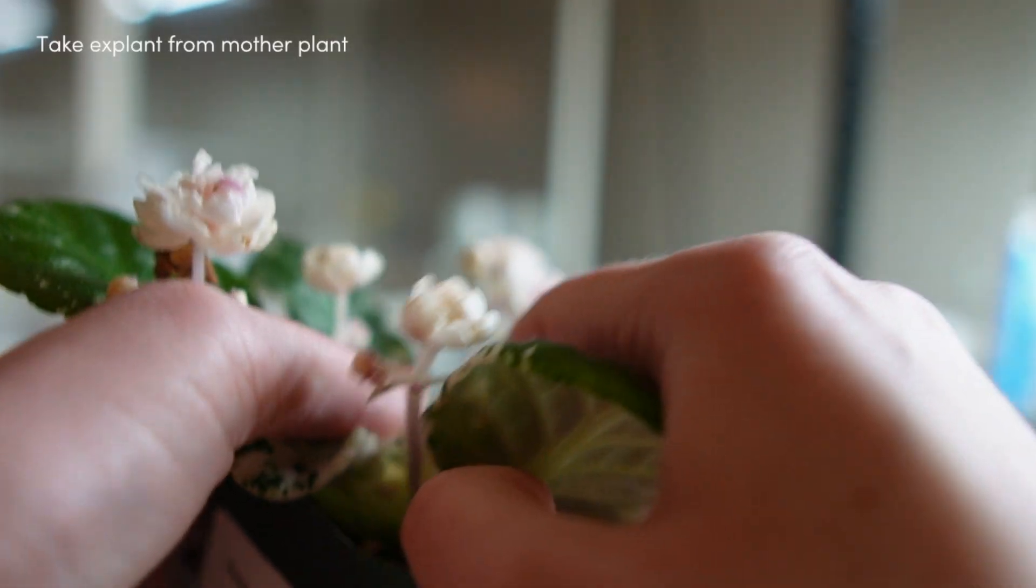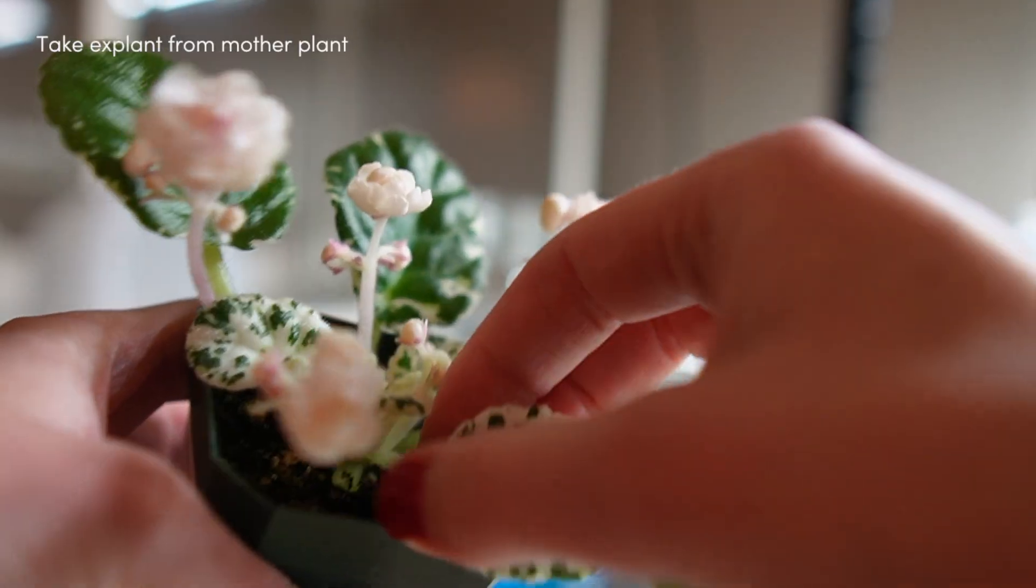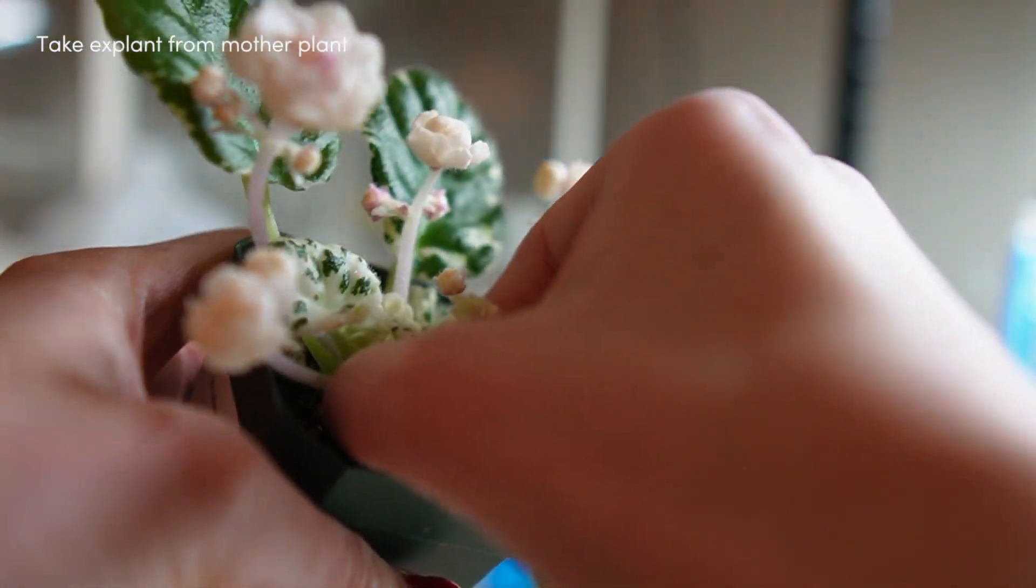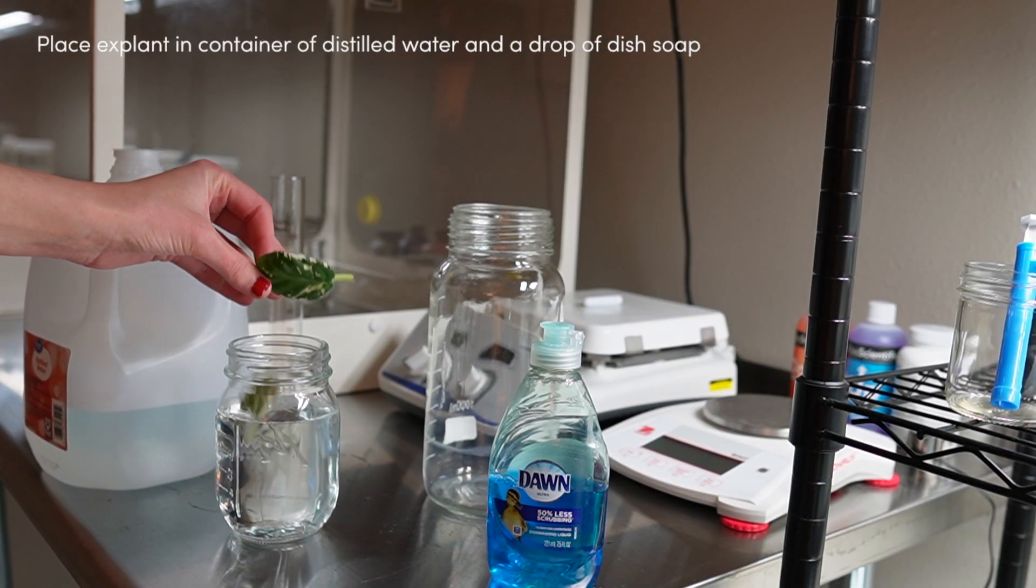Today I'll be establishing an African violet in tissue culture. Establishment is the first stage in the tissue culture process. There are four stages total: establishment, multiplication, rooting, and transplanting.